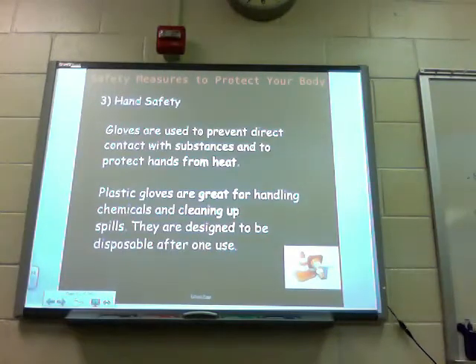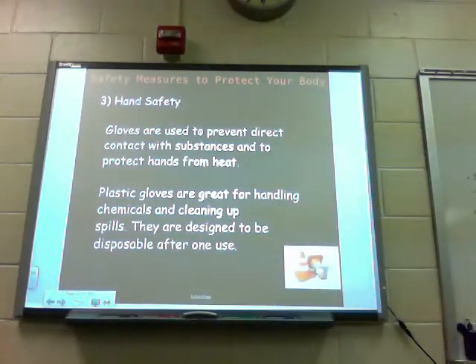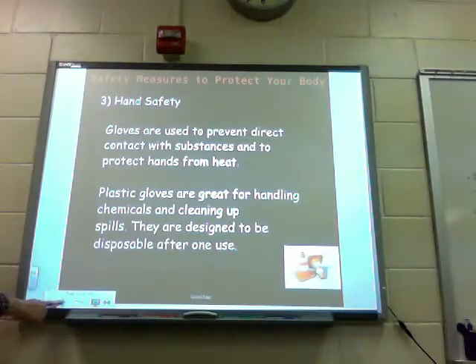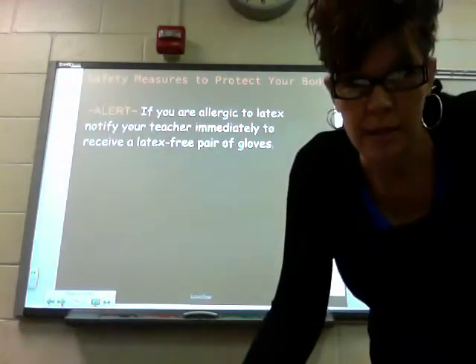Third, hand safety. Gloves are used to prevent direct contact with substances and to protect hands from heat. Plastic gloves are great for handling chemicals and cleaning up spills — they are designed to be disposable after one use. Alert: if you are allergic to latex, notify your teacher immediately to receive a latex-free pair of gloves. If you don't tell us, we won't know.